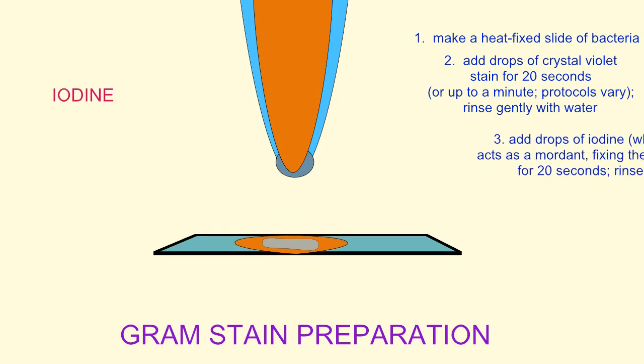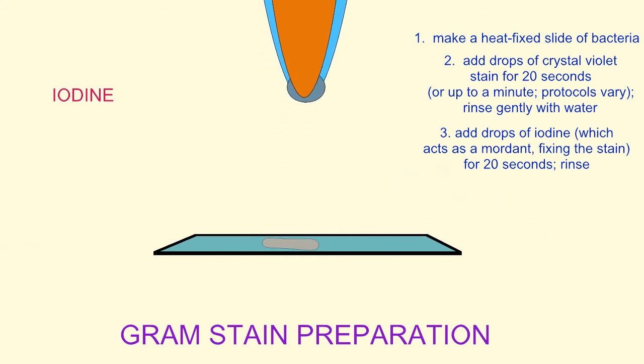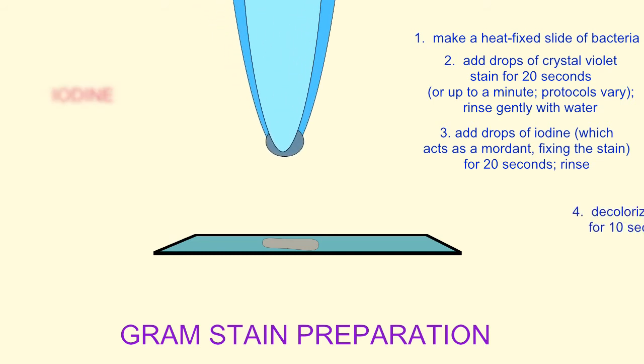Next, a few drops of iodine are applied to the sample. Iodine acts as a mordant — it helps to fix the primary stain, the crystal violet, in the cross-linkages of the peptidoglycan cell wall of gram-positive bacteria. After about 20 seconds, water will gently rinse it away.